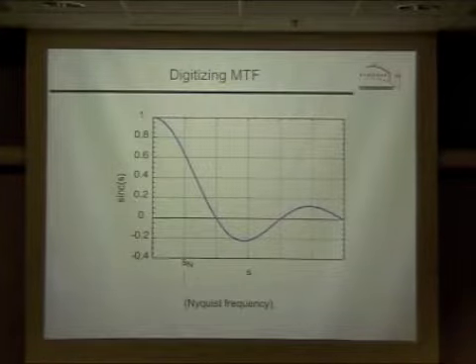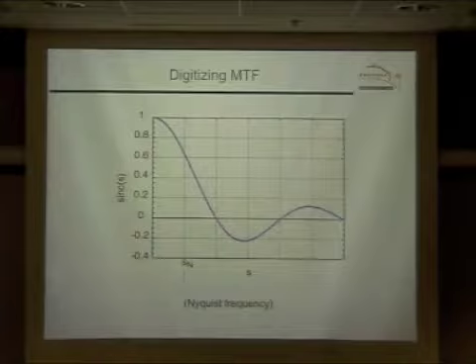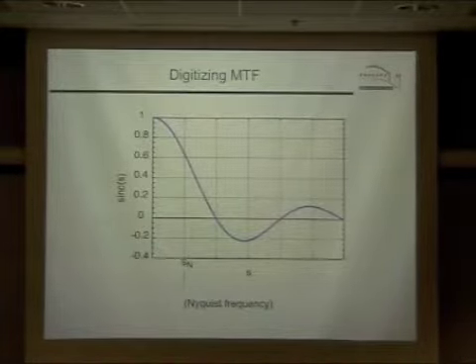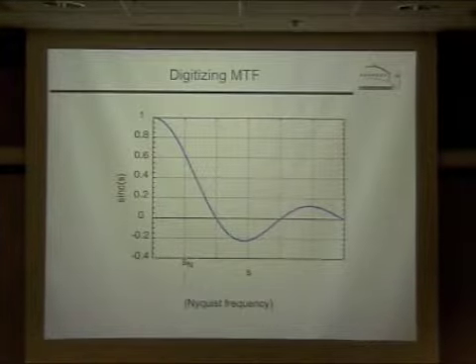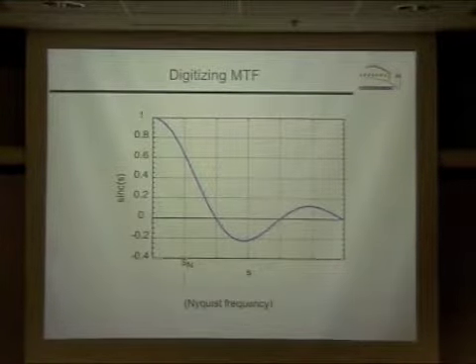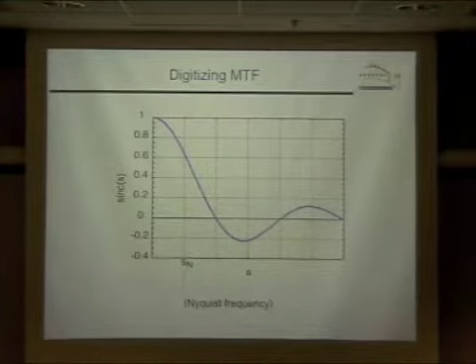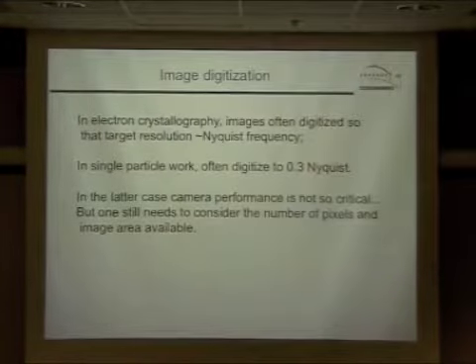And most of the systems that have been talked about have an MTF of their own. The whole system MTF drops to about 0 here, so that this aliasing is not an issue. But it is an issue for something like film digitizing, where the response of the system might be a lot better, or if one could develop a CCD type system where the MTF was really good at very high frequencies. Just something to watch out for, but keep that in mind.